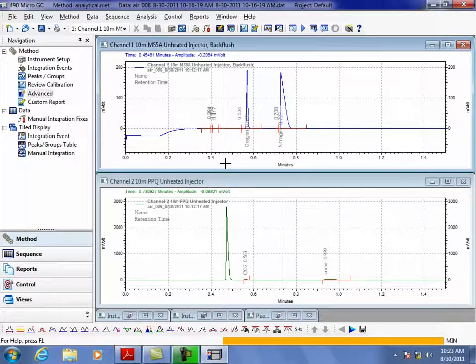We'll walk and try to interpret. We want to ask why and do those things here, and how we do it in the future. So we'll take an informal approach and understand the reasons behind. So for example, why do we set at 70 degrees or why do we set at 90 degrees? There's a big difference in the future. But I guess we'll do a little informal way in the afternoon session.